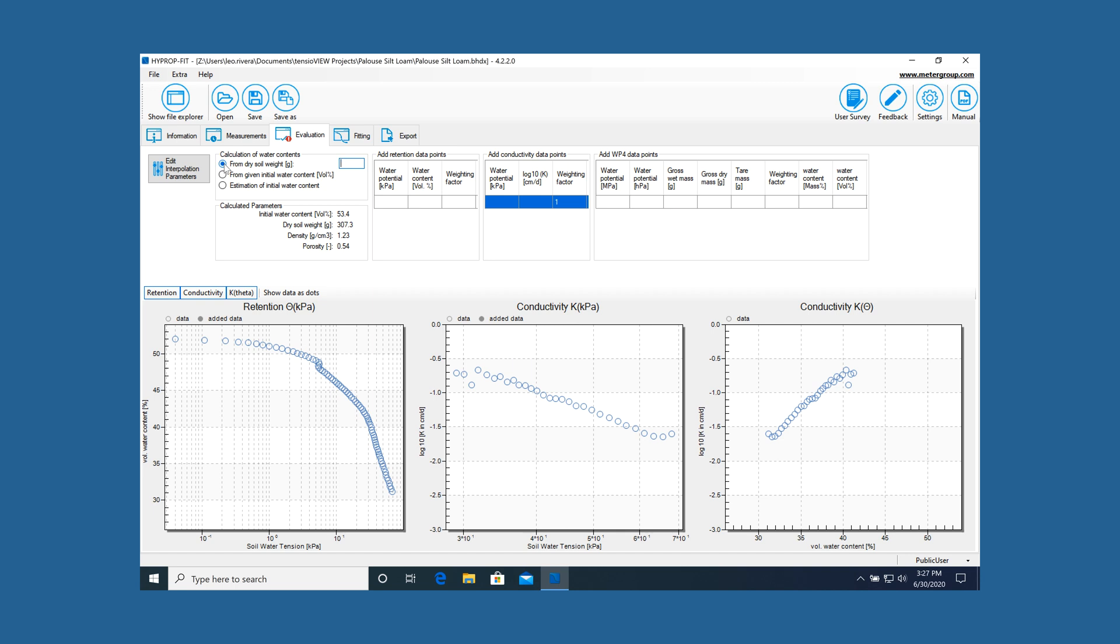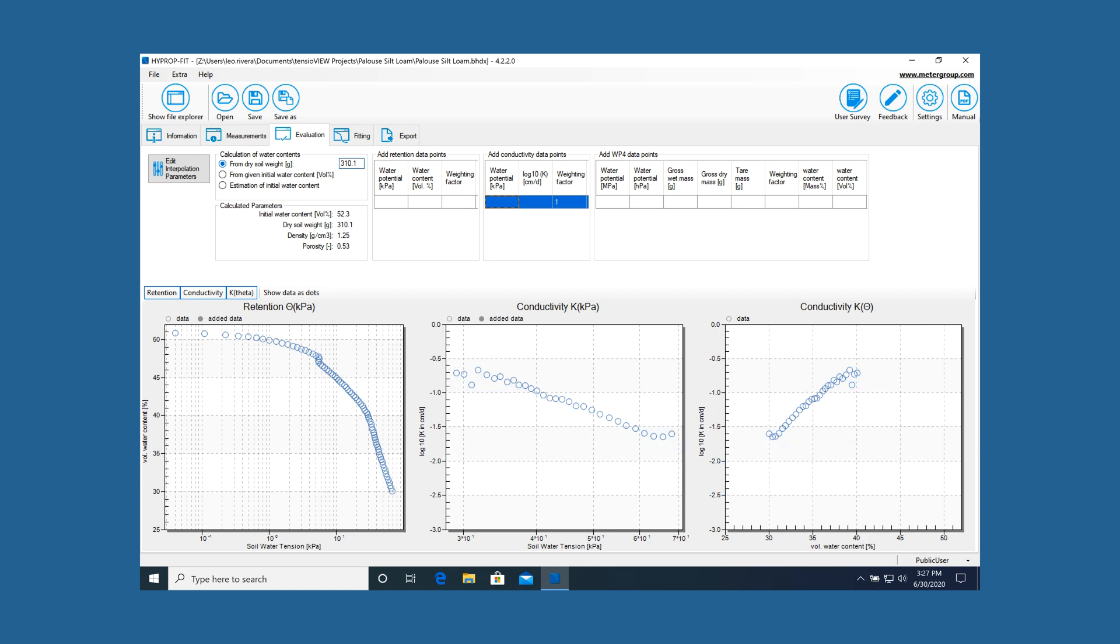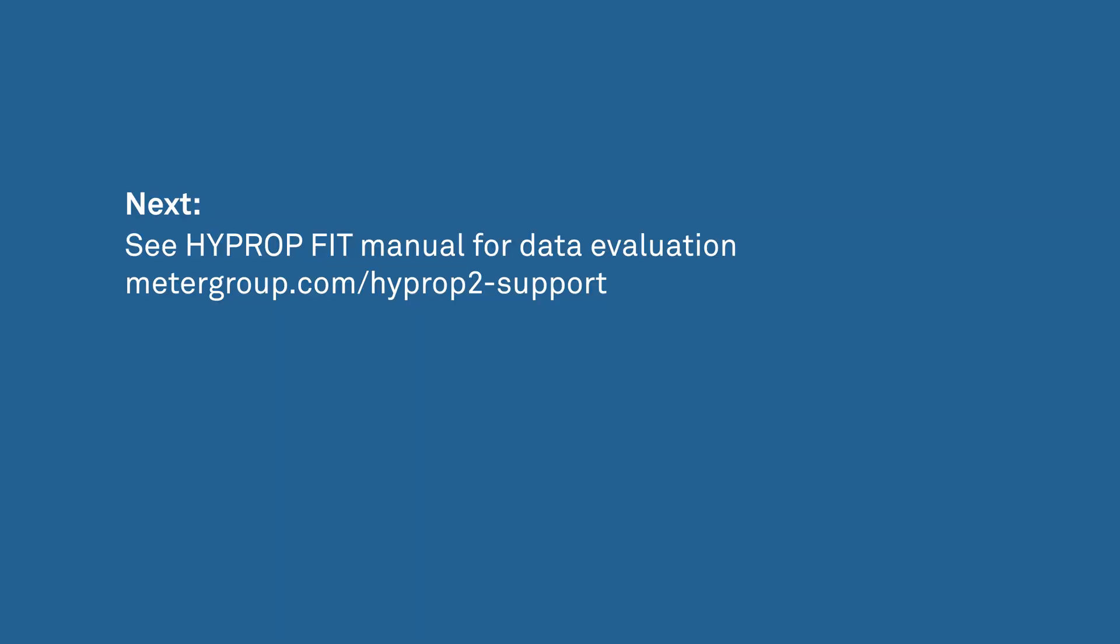Weigh the sample and enter the net mass of the dry soil sample in the HYPROP-FIT software using the register evaluation. The HYPROP is now ready to calculate the volumetric water content.